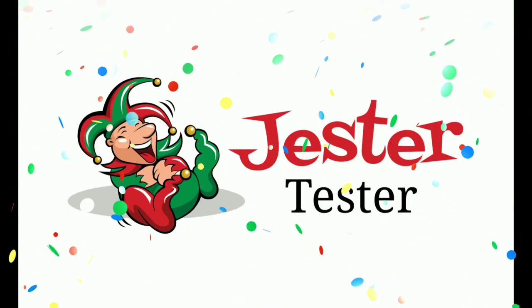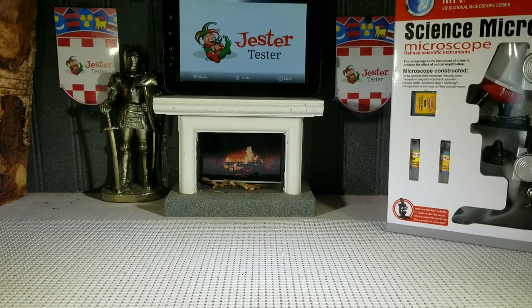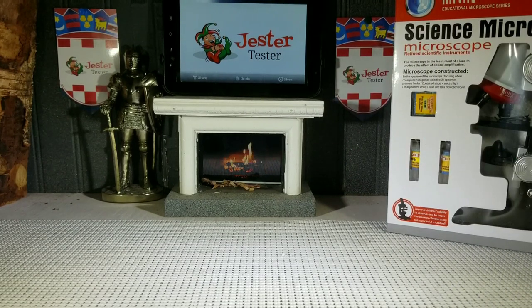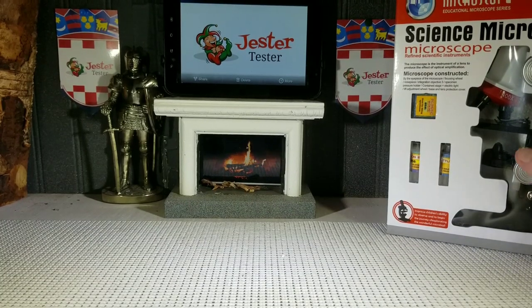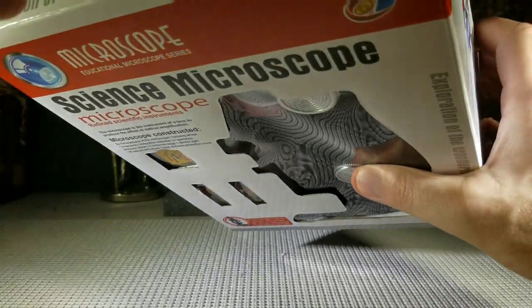Jester Tester, an honest review for you! Hello everyone, Jester Tester is back with another review. This time, we are reviewing the Toy Microscope by YX. Here it is — this is the way it comes, in a nice box like this. Let's open it up and take a look at it.